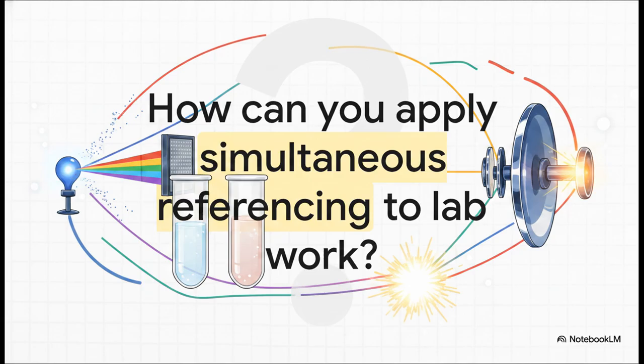I'll leave you with this thought. How might you apply this brilliant concept of simultaneous referencing, of checking a control at the exact same time as your variable to eliminate unwanted noise and errors in your own future scientific endeavors?